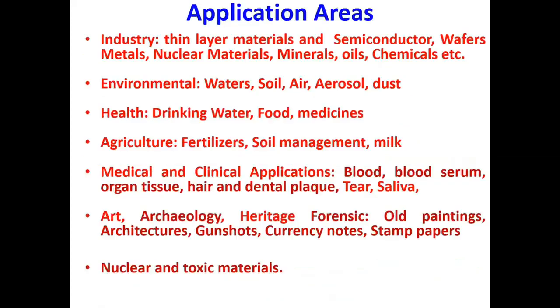Because of these advantages, it finds application in various industries and application areas. In industry, thin layer materials, semiconductor wafers, metals, and nuclear materials can be analyzed, and I will show some new types of application. Also minerals, oils, chemicals, etc. In environmental analysis, water samples, soil, air, aerosol, dust.